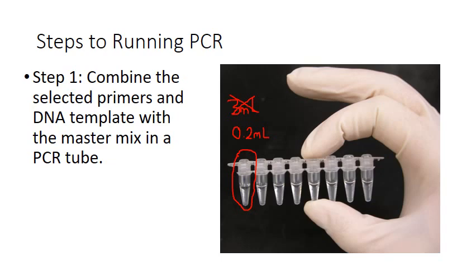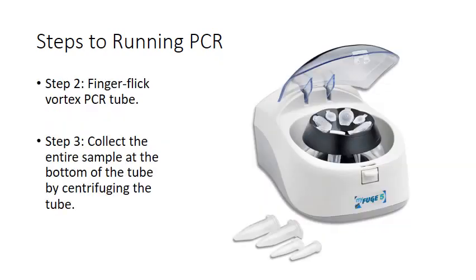That is a really small amount, essentially 200 microliters. So that's the most you can put as far as volume inside your sample. These tubes are really small. We're going to show you some of that when I get to the lab, showing you what these PCR tubes look like, and you have special PCR tube racks and all the other fancy stuff. So 0.2 milliliters are these PCR tubes.